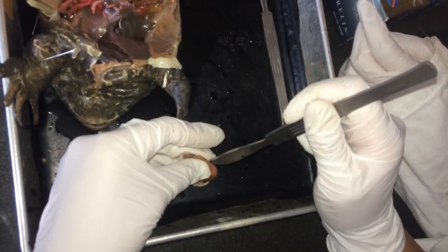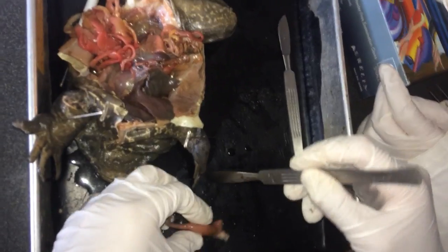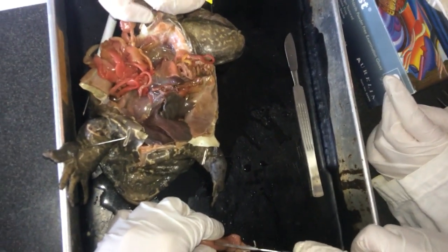Or you could use scissors. This bugs me. Oh, that's so cool. Mm-hmm.